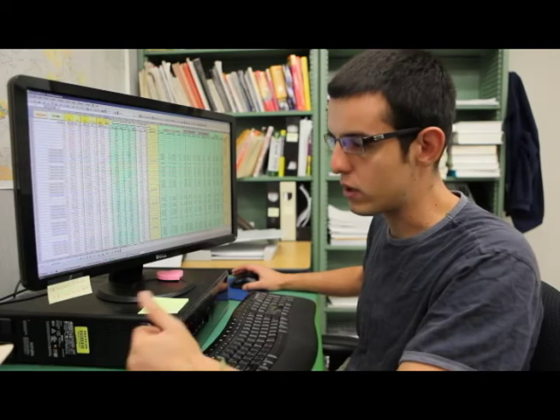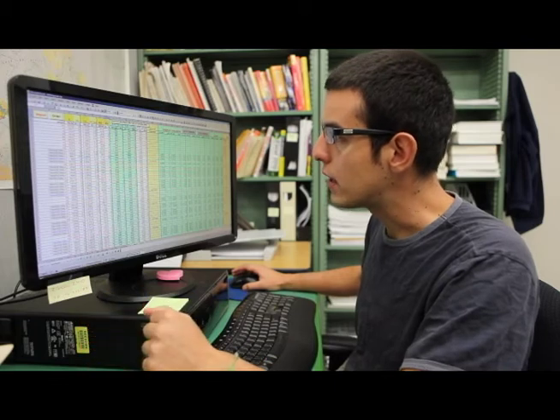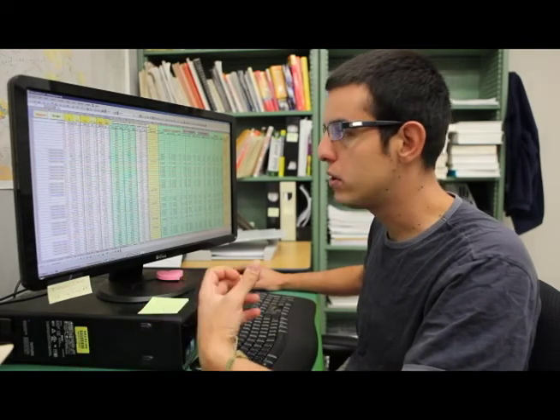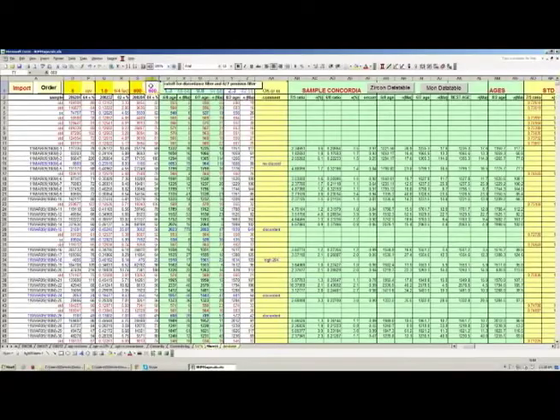Because we know now that as you go younger, those uncertainties in the measurements are larger. And also, the discordance filters are not going to be applied. So in general, we usually have this factor just being between 600 Ma and 400 Ma. And then depending on how your data looks and what analyses are being rejected in column AA, you can modify that.